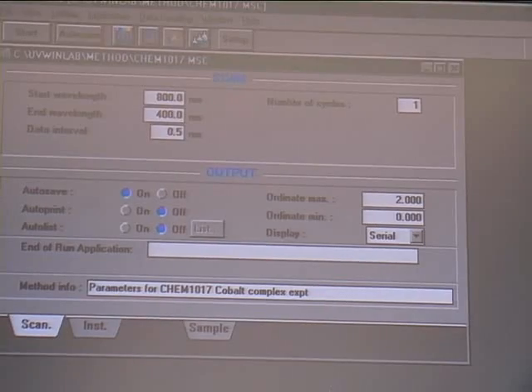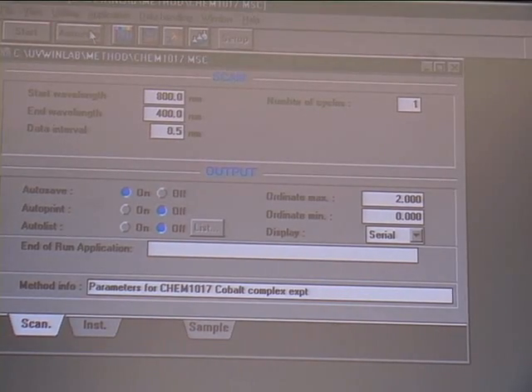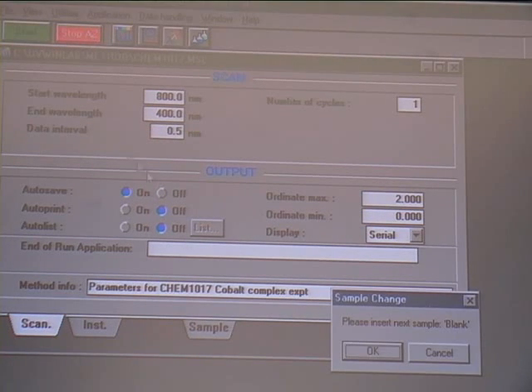To run the reference you click AutoZero in the UV-Vis program and click OK.